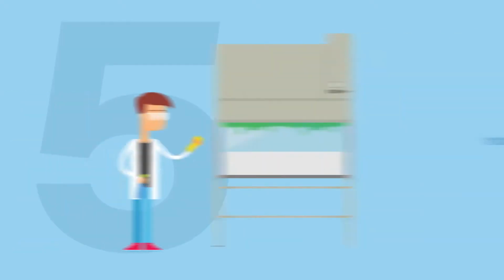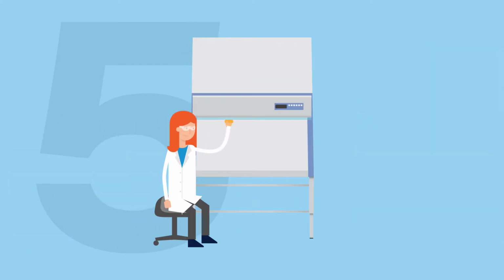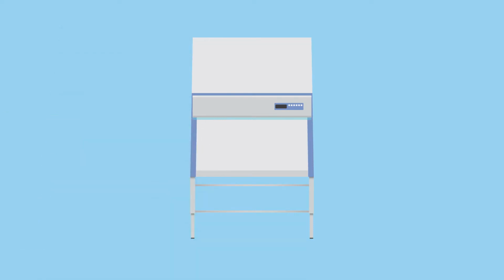and downflow. One of the least appreciated factors affecting contamination is ergonomics. Restricted movement is not only uncomfortable, it makes managing samples difficult and can prevent complete decontamination of interior surfaces. Ergonomically designed BSCs should allow for easy access to the interior and have a flat work surface without cracks, bends, or corners capable of harboring contamination.